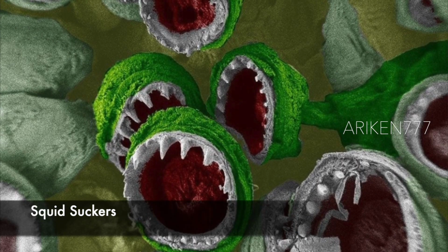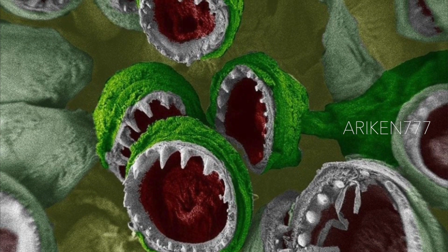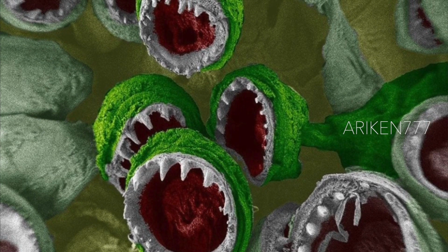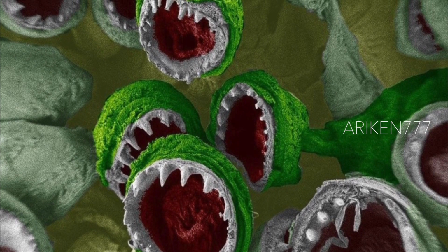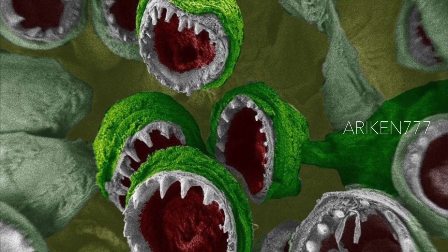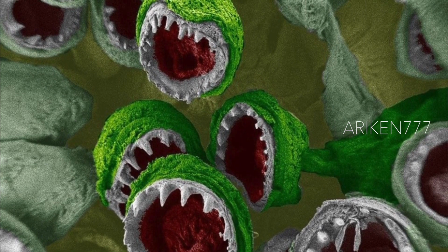These are the suckers of a long fin inshore squid which they use to grasp prey. These squids are found in the North Atlantic, schooling in continental shelf and slope waters from Newfoundland to the Gulf of Venezuela. They are commercially exploited and the population makes seasonal migrations that appear to be related to bottom water temperatures.